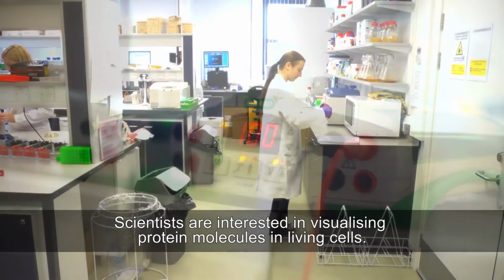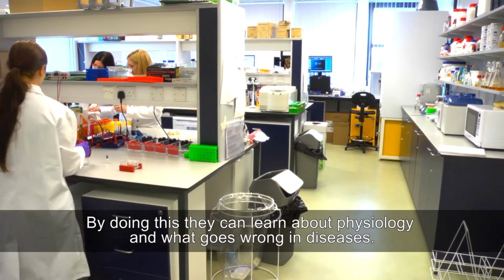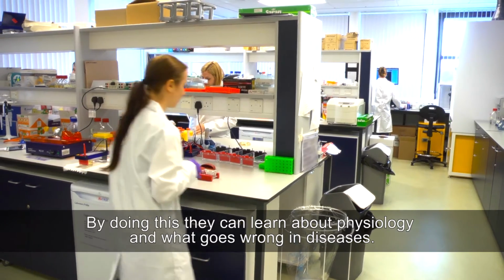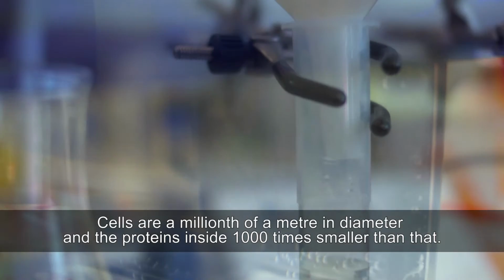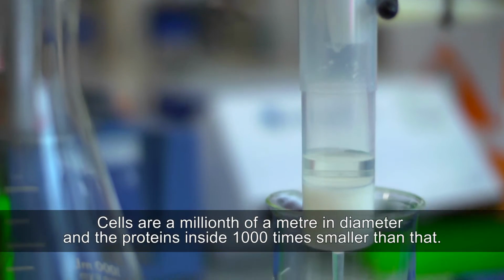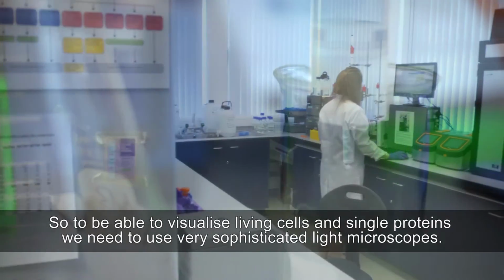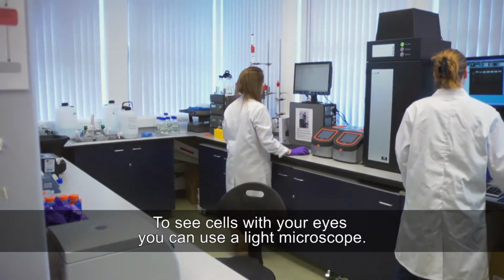Scientists are interested in visualizing protein molecules in living cells. By doing this, they can learn about physiology and what goes wrong in diseases. Cells are a millionth of a meter in diameter, and the proteins inside 1,000 times smaller than that. So to be able to visualize living cells and single proteins, we need to use very sophisticated light microscopes.